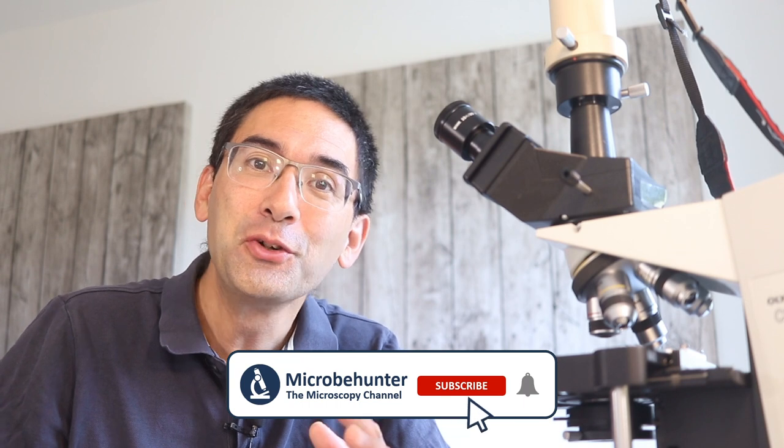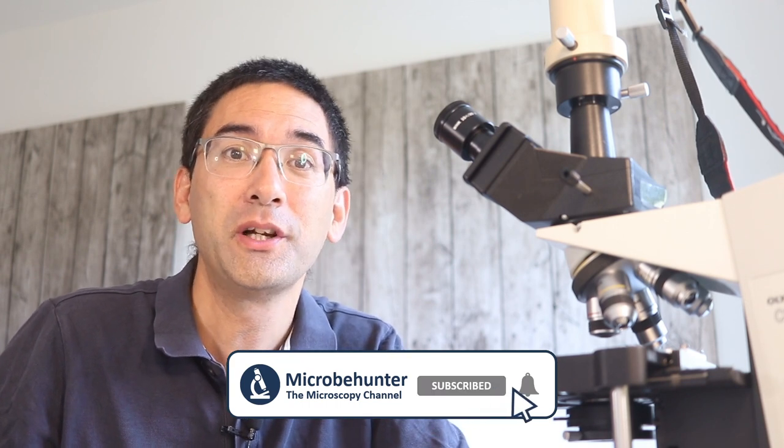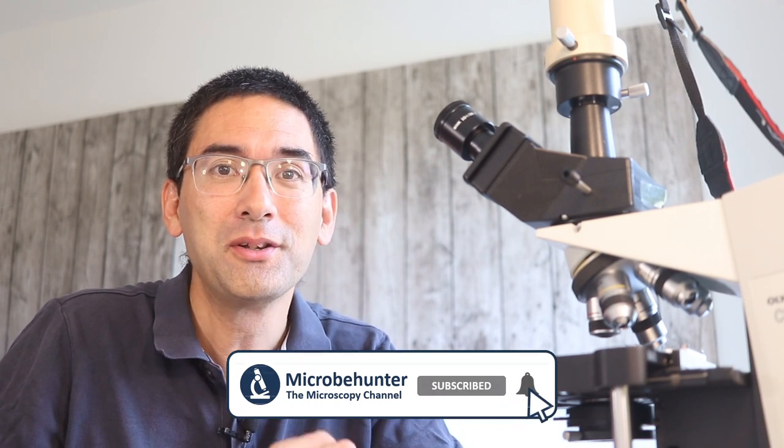Hi, Microbe Hunter here. So you just got your first microscope, you unpacked it, and now you have problems seeing some of the things that you want to look at. This is the video for you — I've received a few emails from people desperately asking for help because they couldn't see anything and were already worried the microscope was broken. I want to simply say: most likely not.